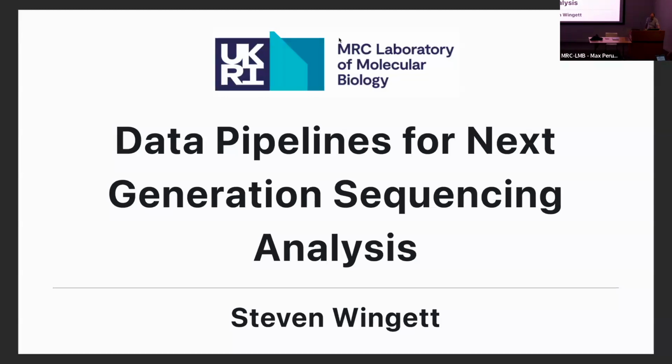So what do I mean by next generation sequencing? Well, you probably know, but I'll just recap for those that don't. This is a newish technology that became widely adopted from around 2010 onwards. Next generation sequencing, or NGS, is a high throughput technology that allows for millions of different molecules to be sequenced simultaneously. It was a transformative technology, for its predecessors only allowed one sequence to be deduced at a time. This innovation, also known as massively parallel sequencing, enabled the development of numerous game-changing molecular biology techniques.